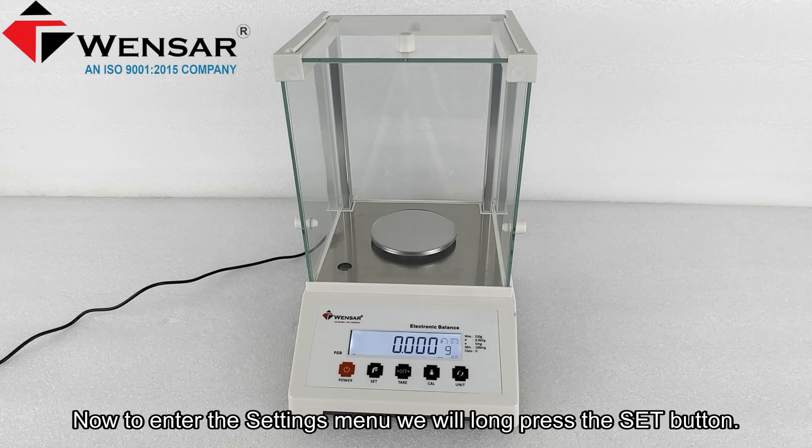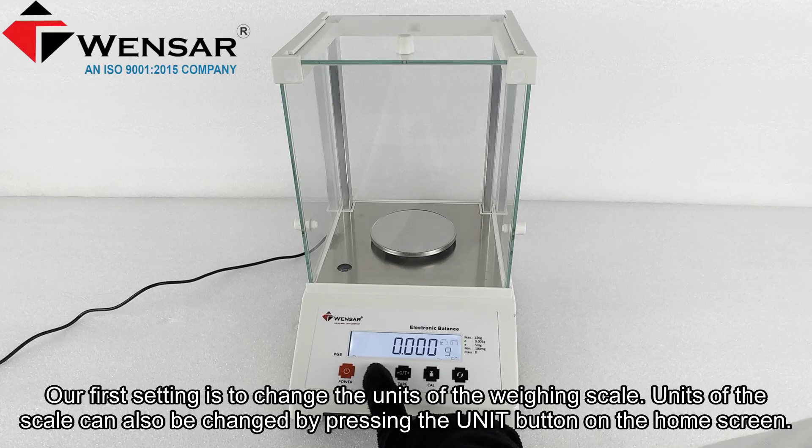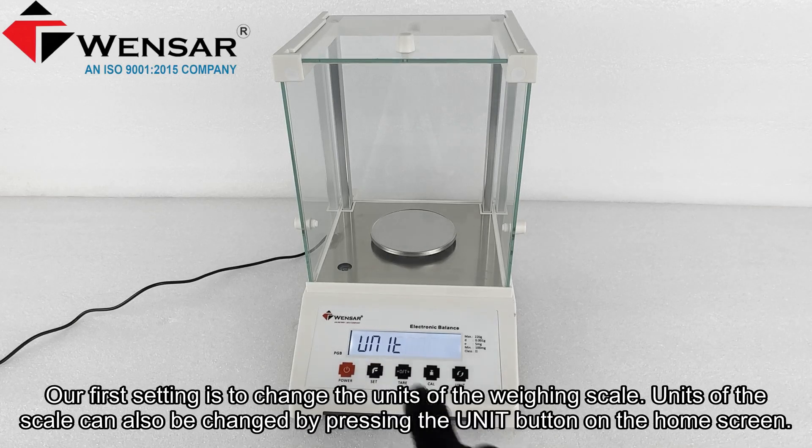To enter the settings menu, we will long press the set button. Our first setting is to change the units of the weighing scale. Units of the scale can also be changed by pressing the unit button on the home screen.